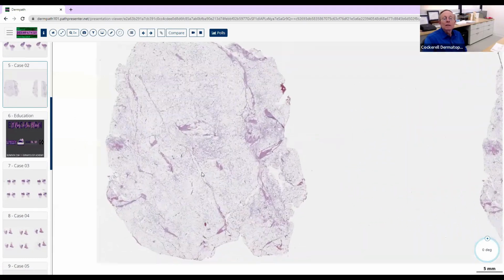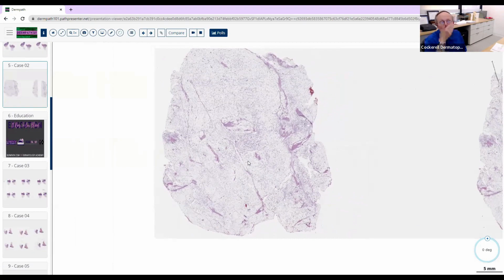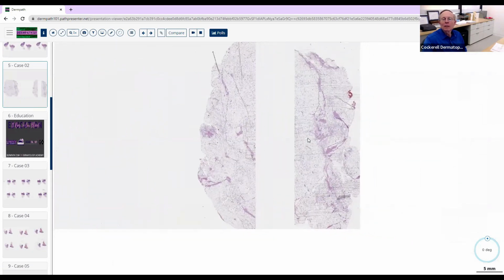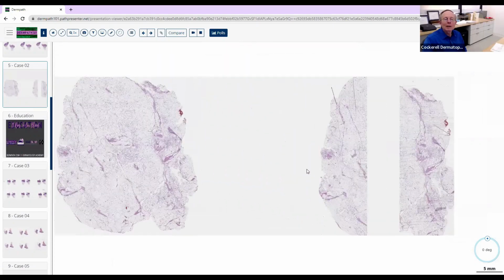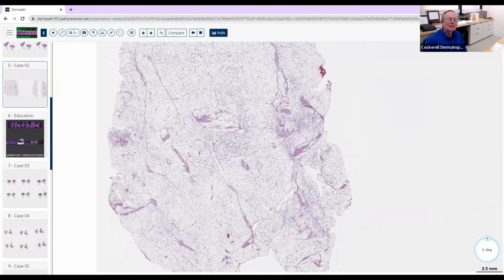Okay, this is kind of an interesting case here too. This is not quite as good as I'd hoped, but at least I think it shows some of the changes over here. Anybody want to give this one a go? I can take this one. It's pretty boring, but it's got some educational purpose to it.